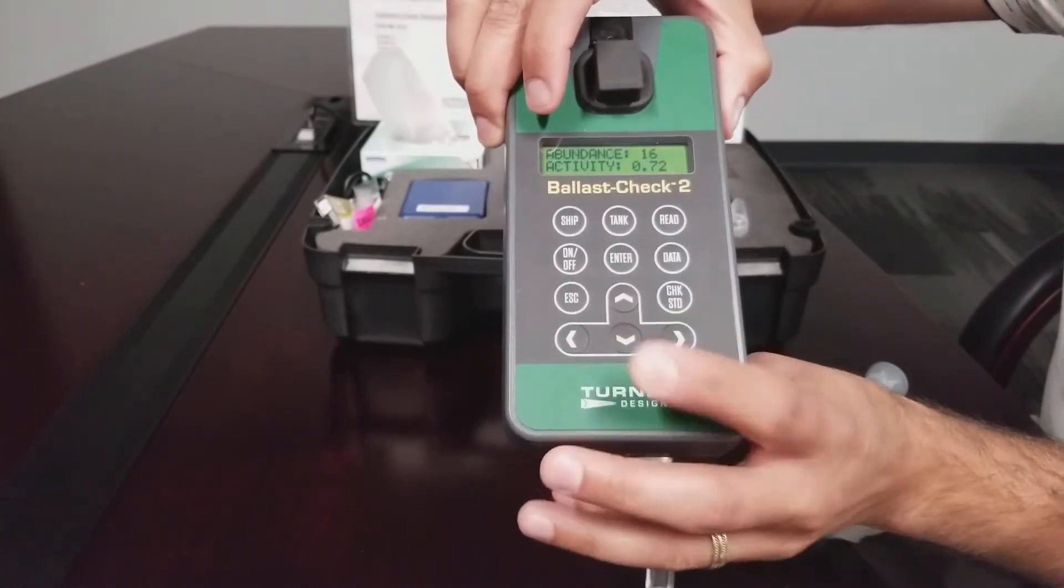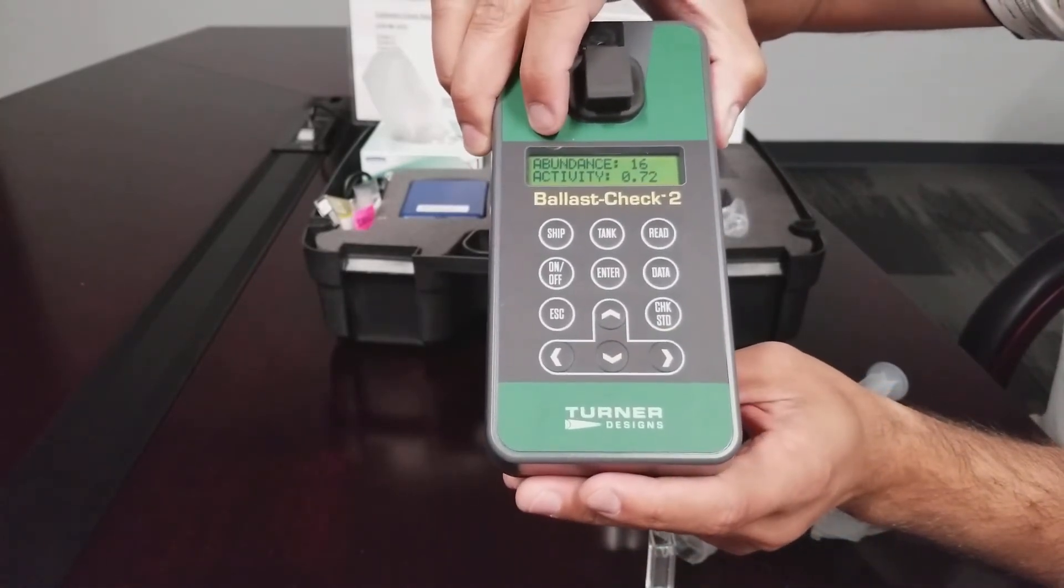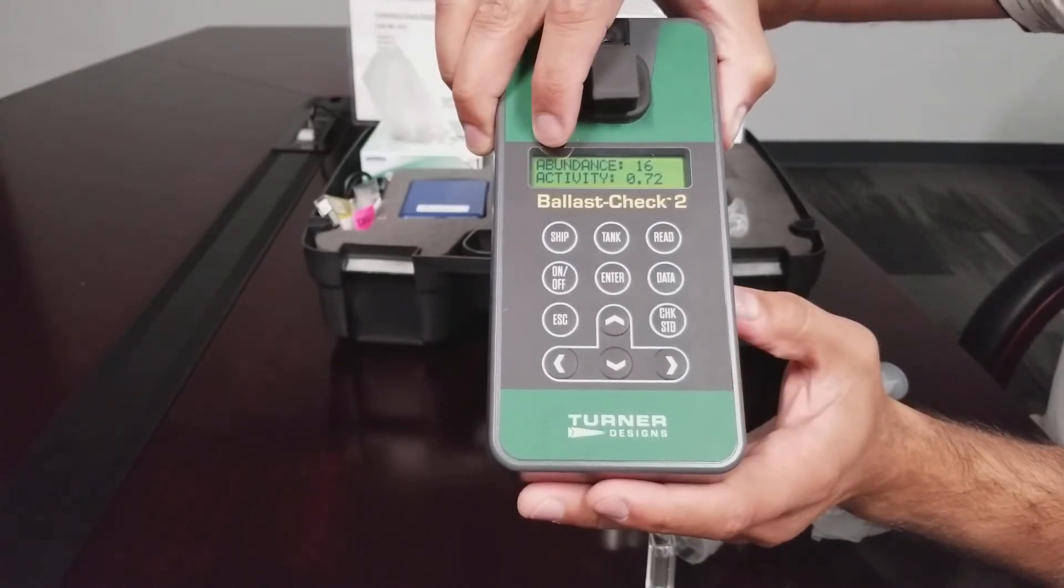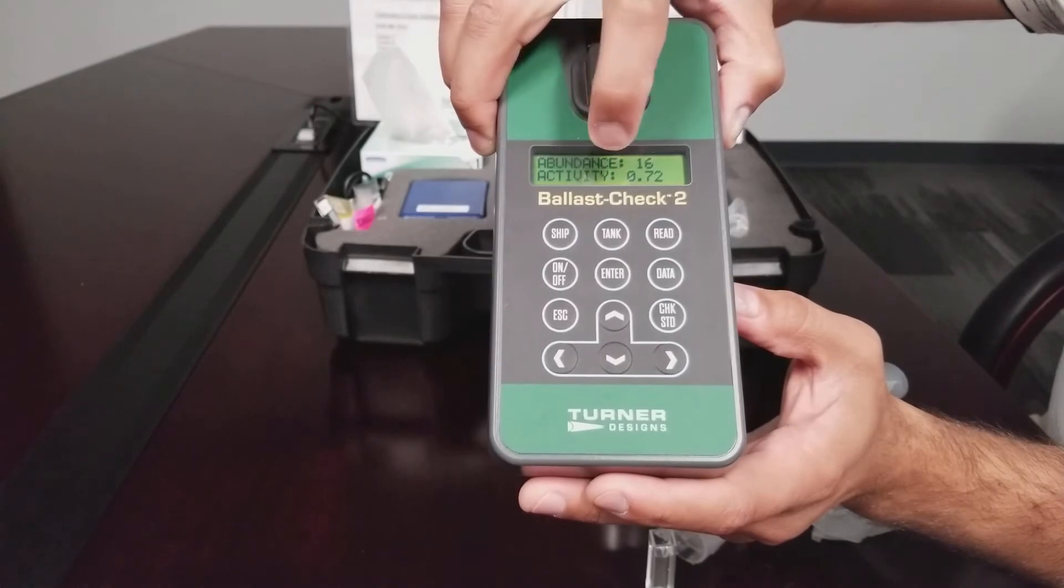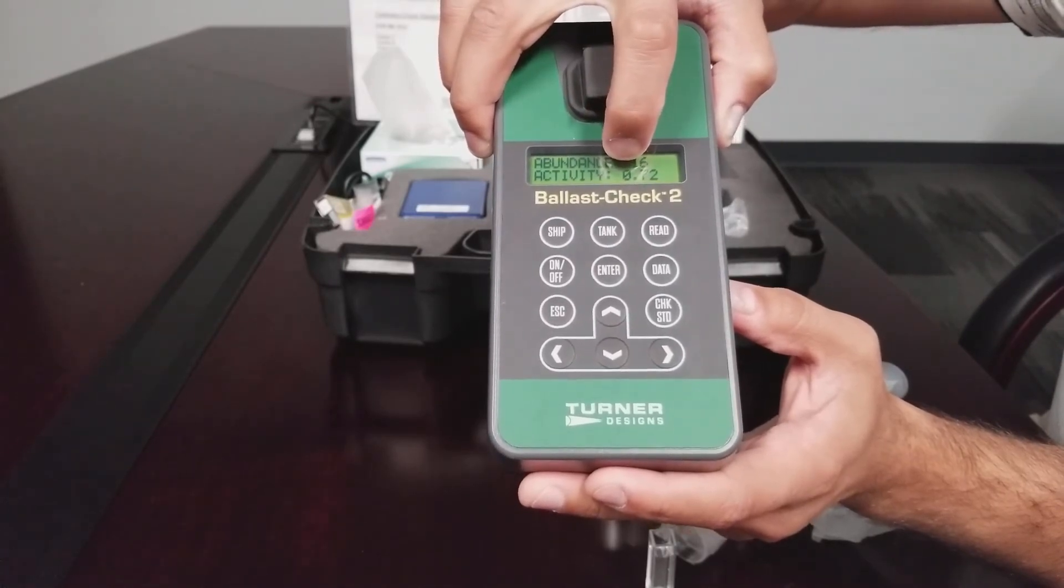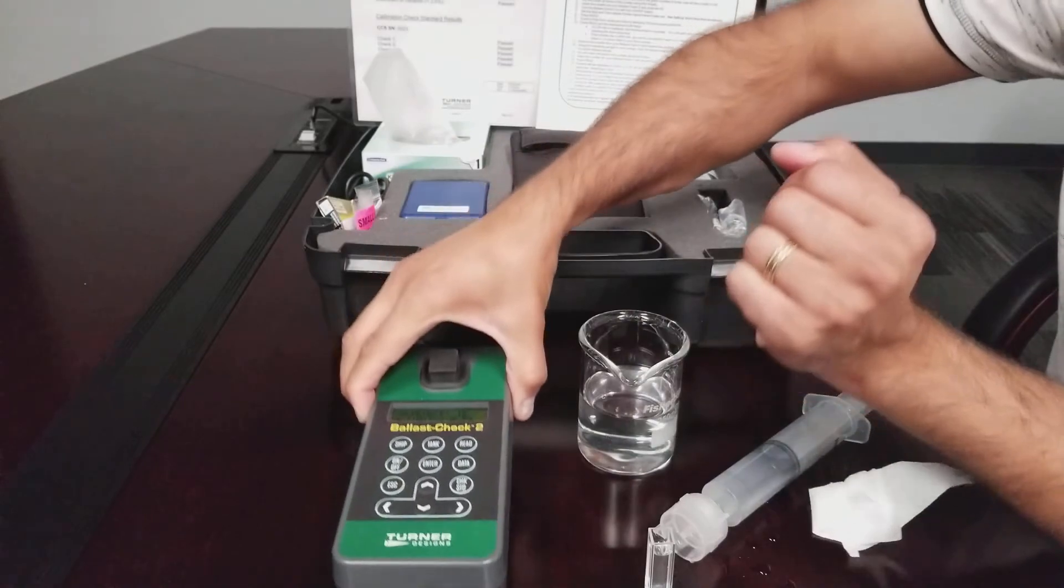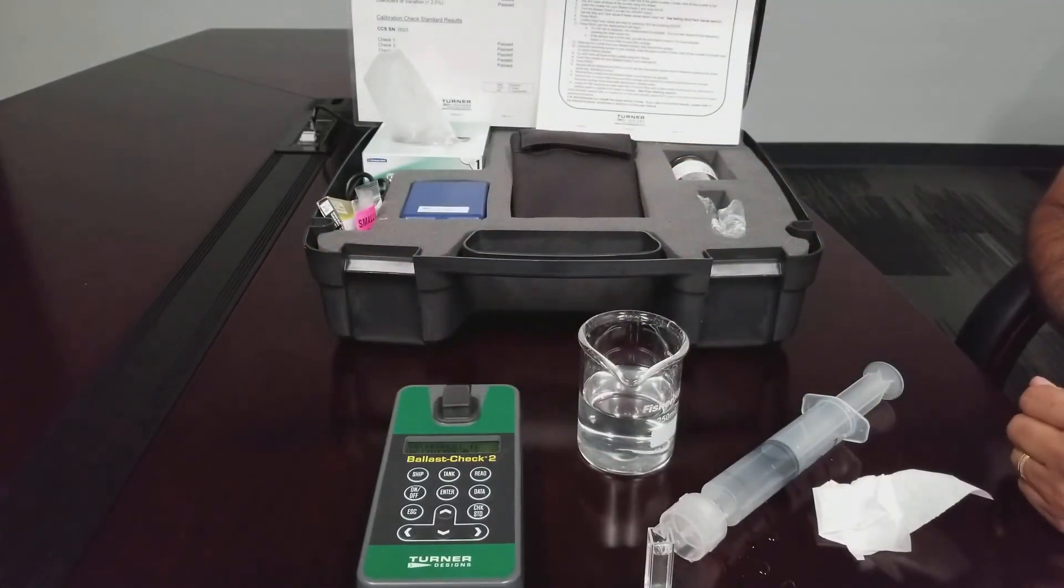Press the down arrow button to view the factors used in calculating risk. Abundance is a quantity of cells per mil. Activity indicates health or viability of cells in the sample.